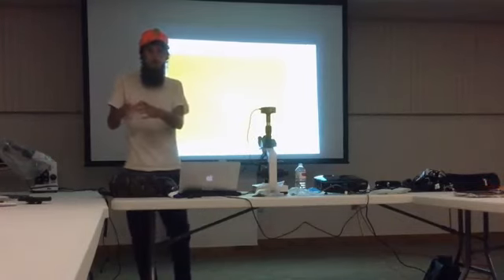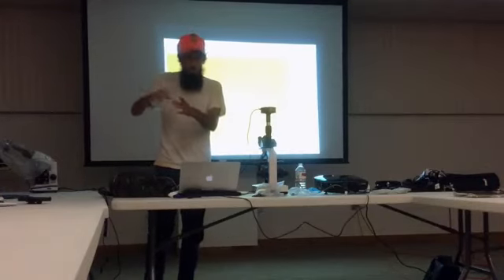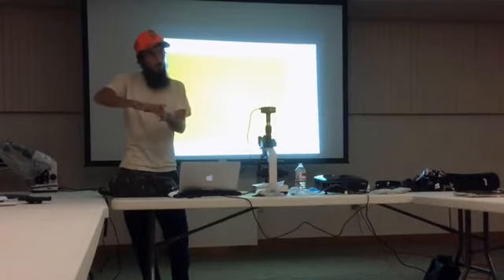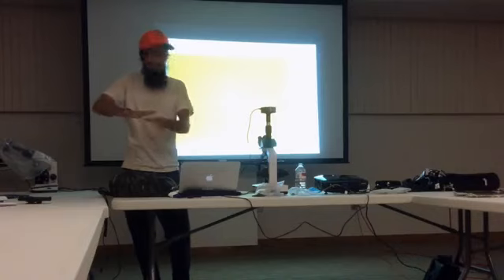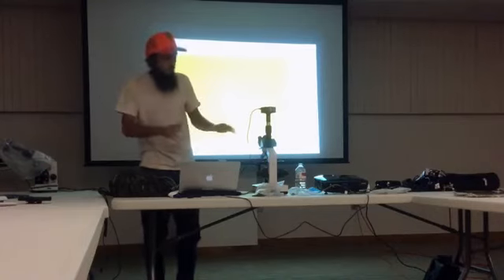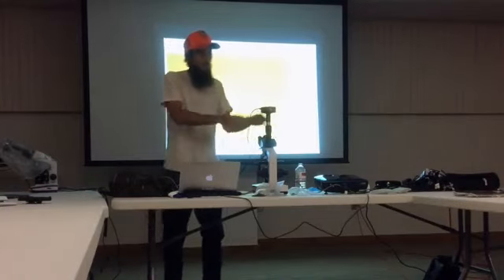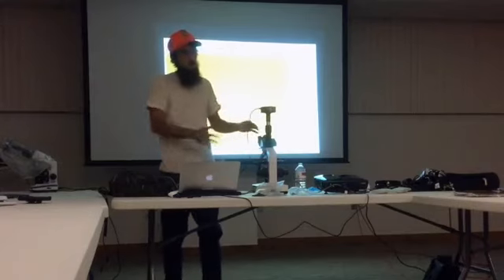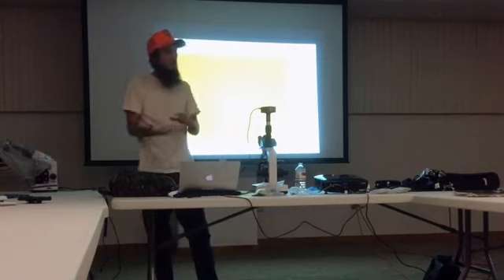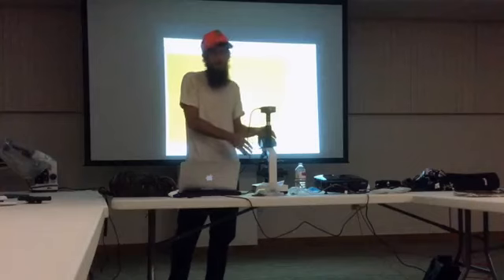In microbiology, you take the sample, you put it on a plate of stuff, and it grows, right? When you put the lid on top and cut off the oxygen, only stuff without oxygen is going to grow, and only stuff that grows on that medium. With this microscope, you can see stuff that grows in the soil and stuff that grows with oxygen. Using this live method versus trying to plate to see what's going to grow gives you much more of an idea of what's happening in the soil.